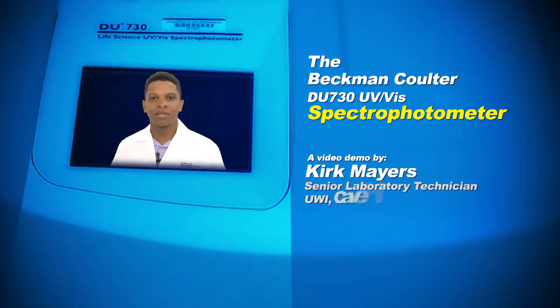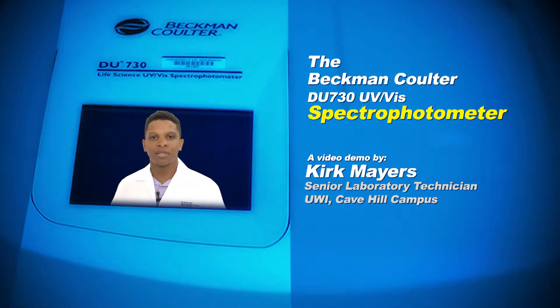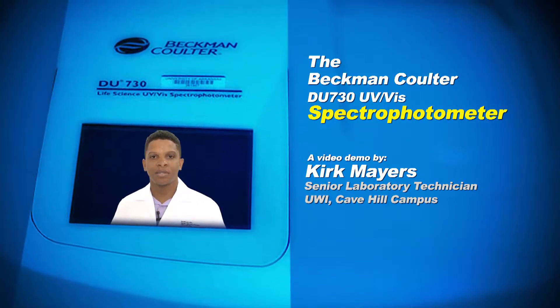We have a simple series of solutions going from 1 microgram per mil up to 10 micrograms per mil. What do you expect to happen as we measure these increasing concentrations of solution? You will find out. I'll be going through the use of this instrument today for you to obtain the best results during your practical session.